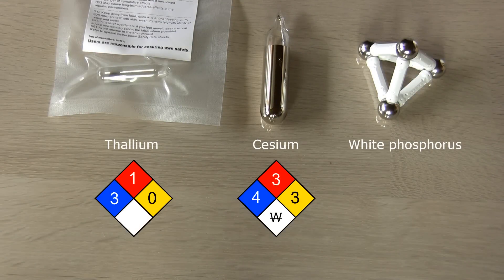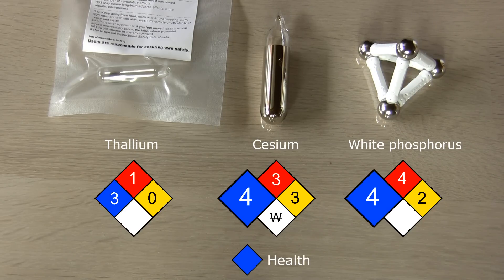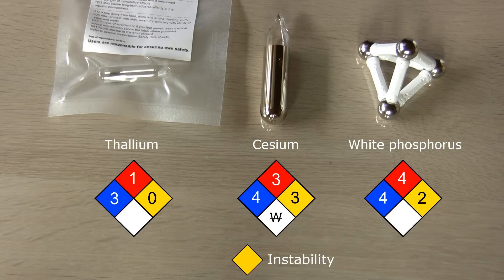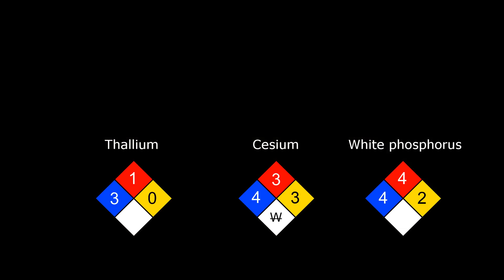This clearly is a dangerous element, but actually it is debatable whether this is my most dangerous element sample. Here are the fire diamonds for thallium, cesium, and white phosphorus. 4 is the worst, 0 is no problem. Both cesium and white phosphorus max out in the blue square which is about health, so even very short exposure to these two is really bad. In the red square about flammability, white phosphorus also maxes out because it is pyrophoric. In my opinion cesium should also max out here because it will ignite in moist air — I'm not sure about the score of 3 here. Cesium scores the highest of these three in the yellow square about instability because it reacts explosively with water and generally is the most reactive metal. So looking at the fire diamond alone, cesium seems at least as dangerous as white phosphorus. Do you agree?